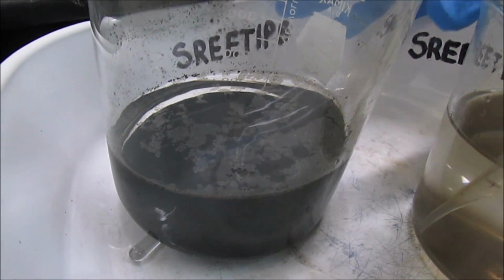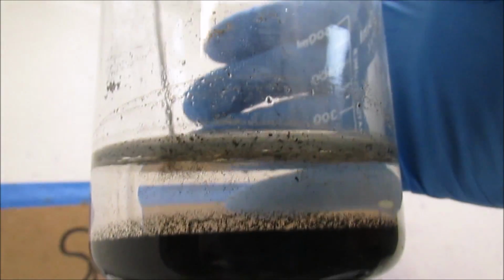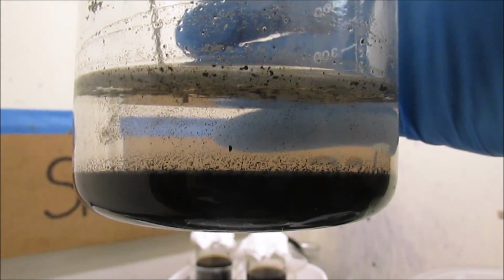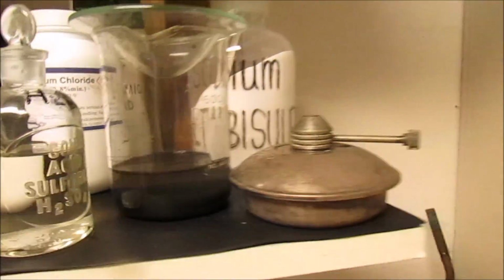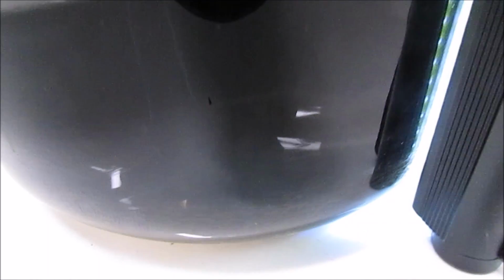It's the following morning. I've got my solution here nice and settled out, as you can see. At least I won't be putting anything back in the solution. I'm going to set this off to the side over here, and then we're going to turn our attention to the main solution. If you look down there, you can see there's some gold or some sediment down here that I want to try to get out.